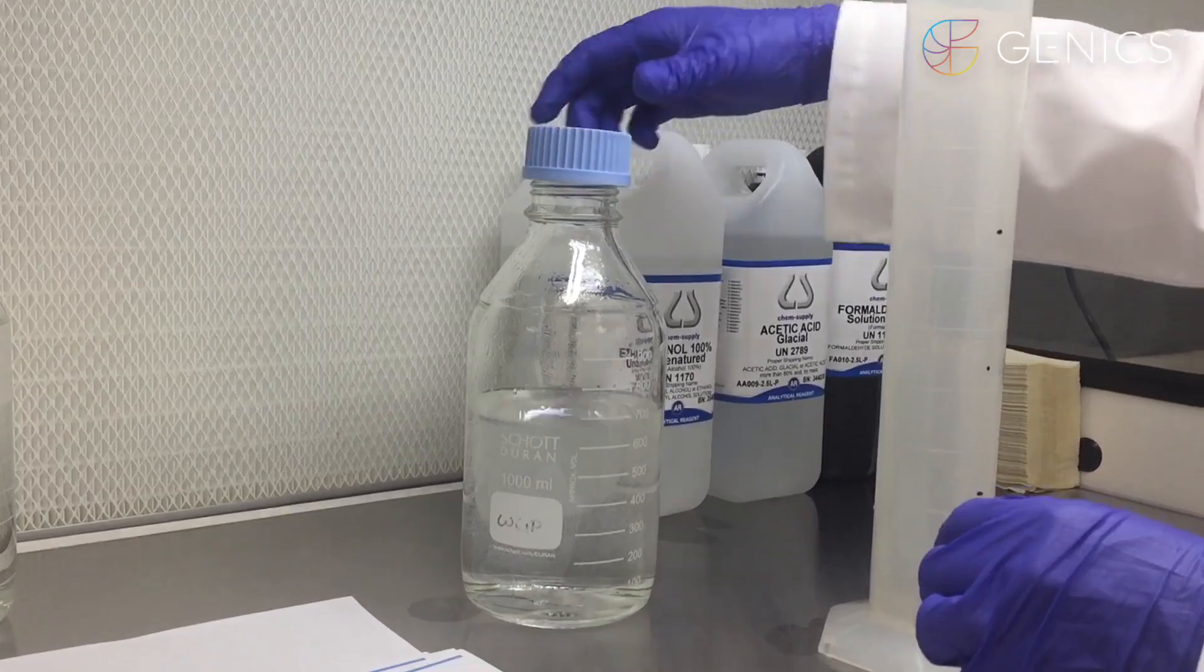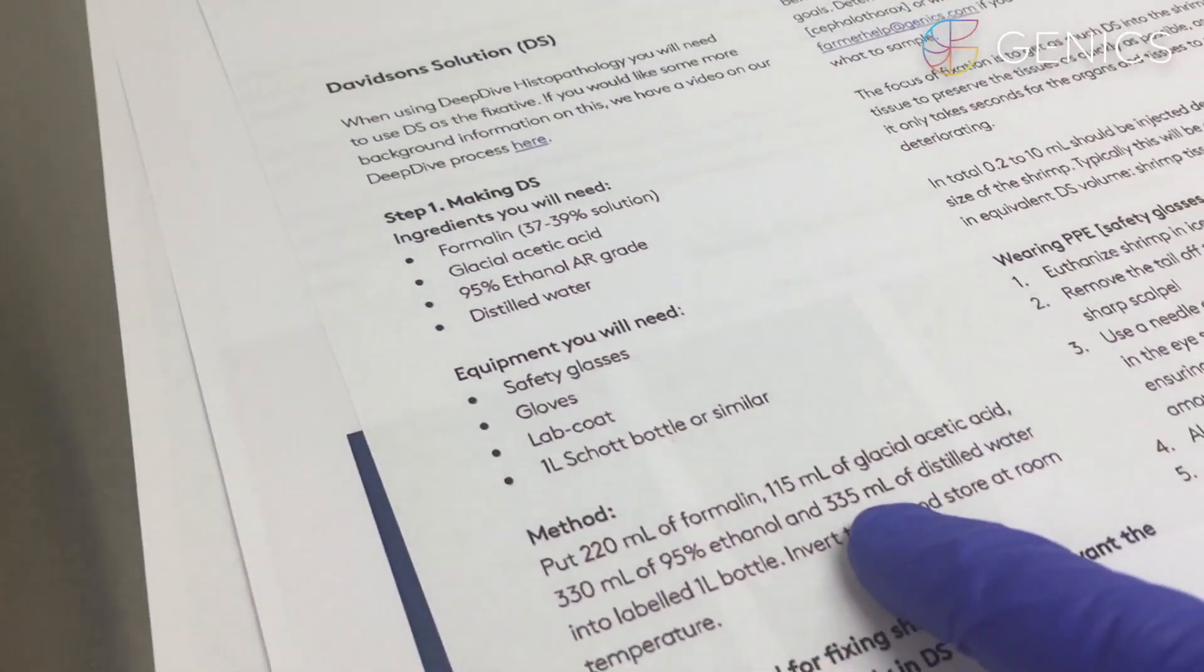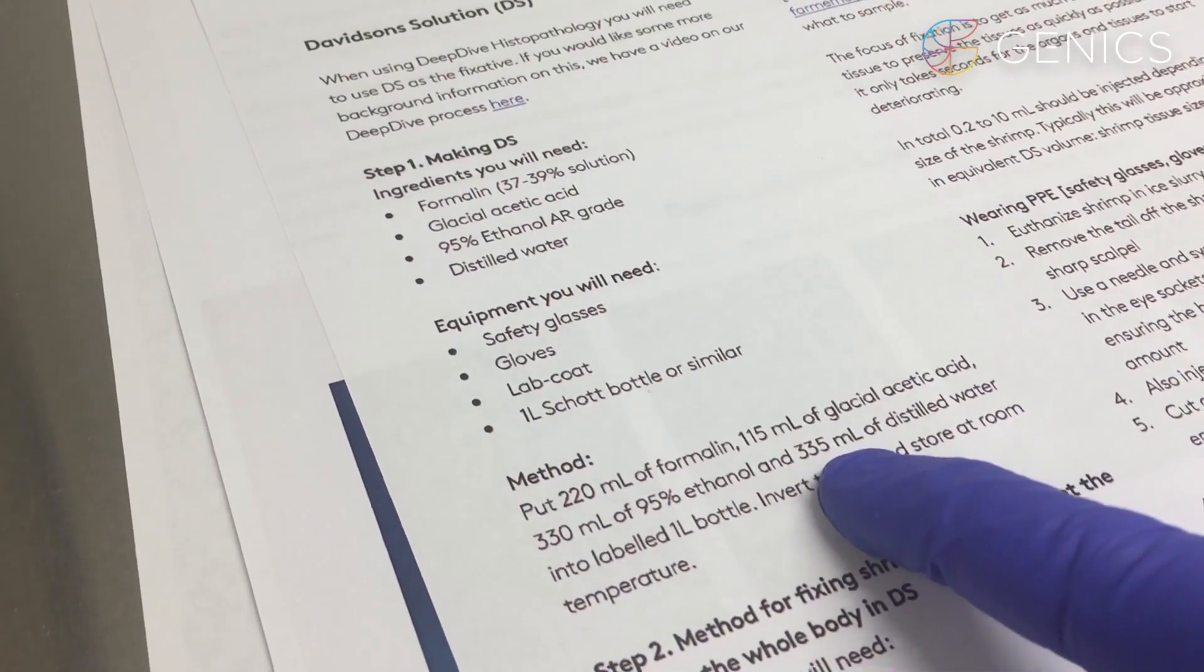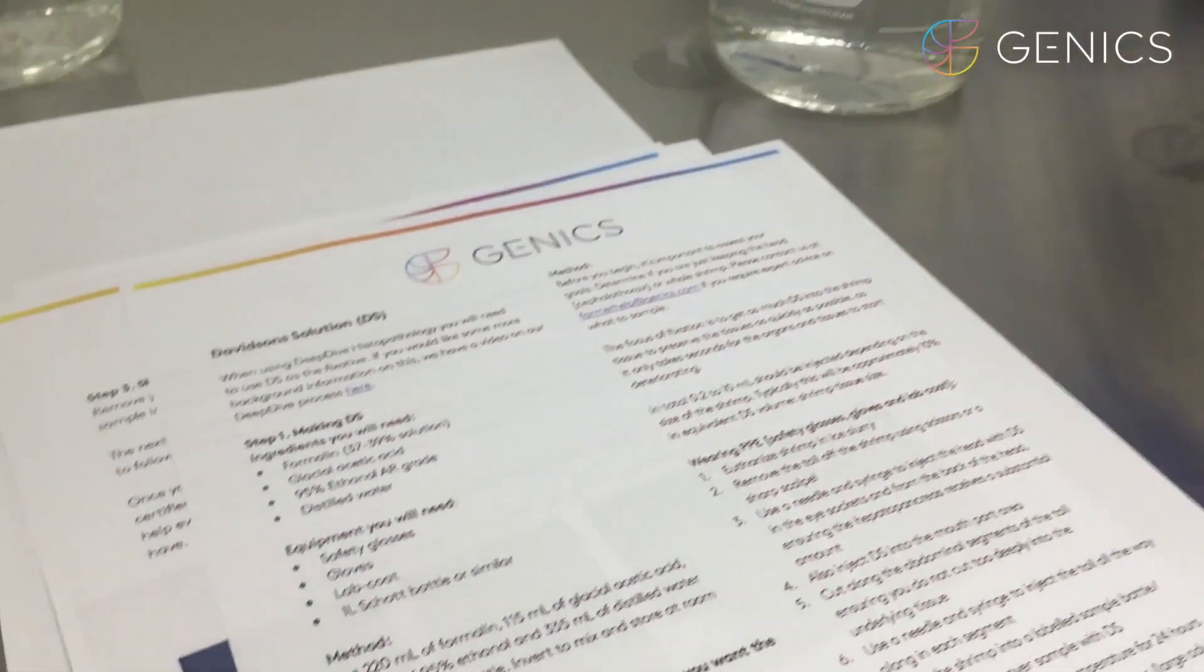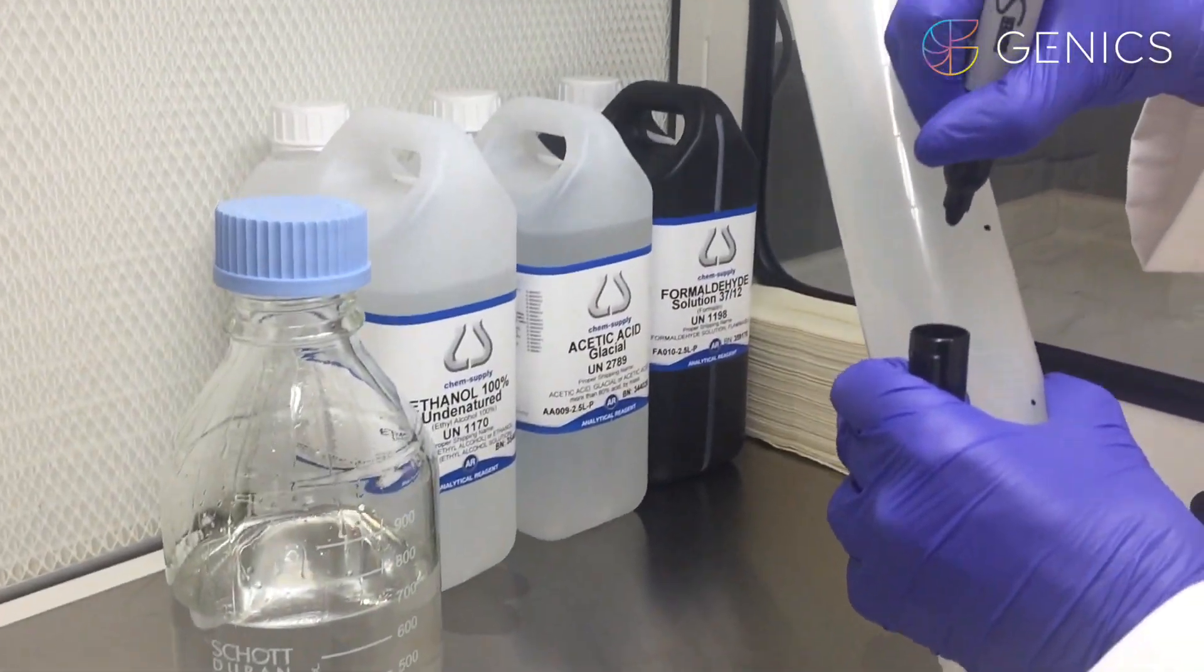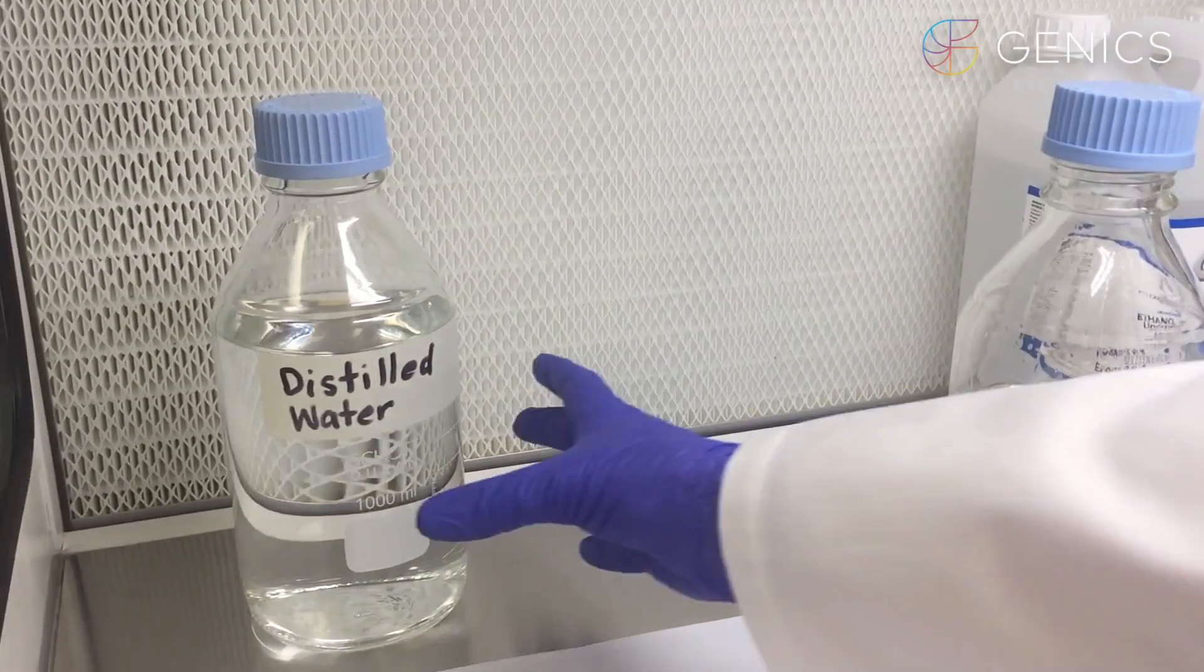Lastly, the fourth thing that we're putting in is our 335 milliliters of distilled water. We can mark our 335 here. We have our distilled water.